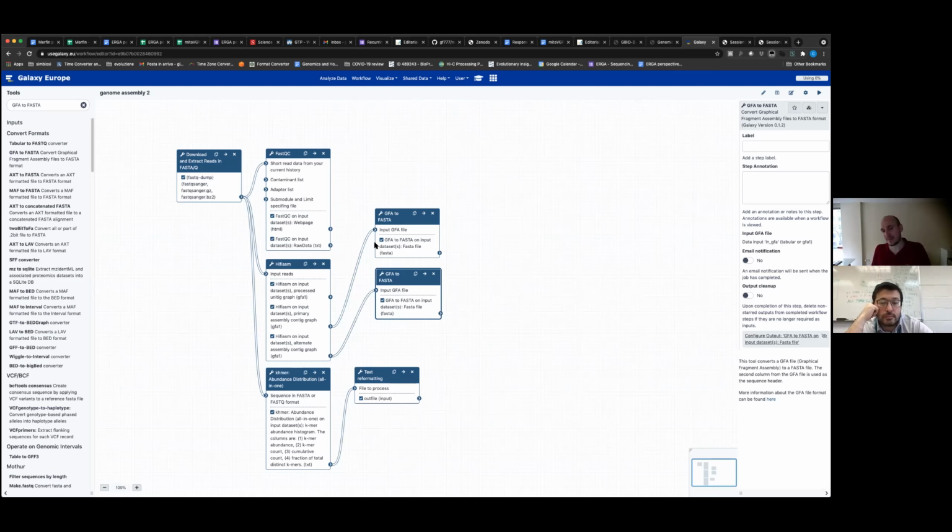In other cases, even if it's, let's say, a haploid cell line, like in the case of yeast or E. coli, they may correspond to some variation, like heteroplasmy or similar, that was actually observed by the tool in your sample.